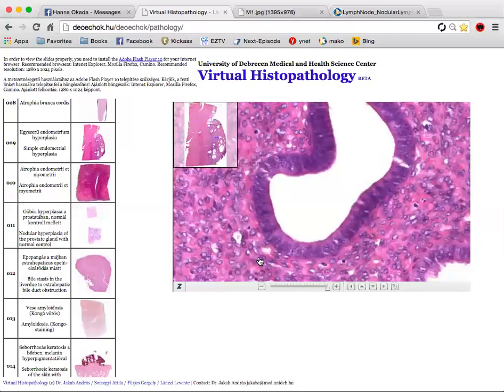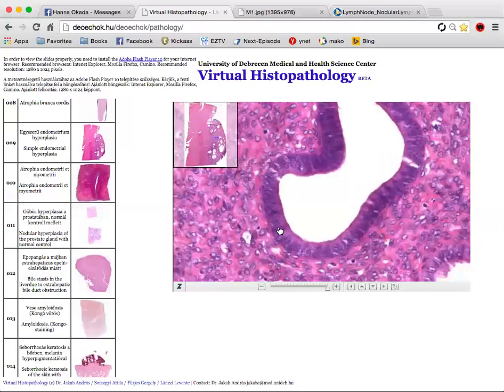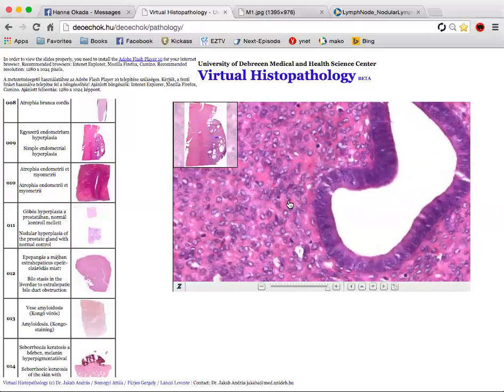And if you look at the nuclei, you see that they're very big, and the chromatin is very loose. It's overall dark staining, but you see this? Very loose chromatin. These cells are active. They're dividing. They're producing proteins.